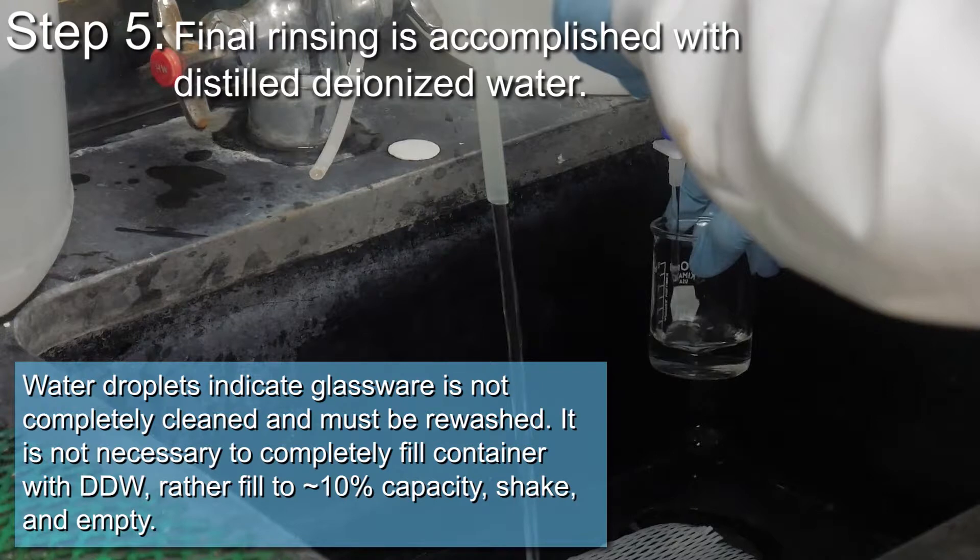It is not necessary to completely fill a container with distilled deionized water, but rather filling to 10% capacity. Shake and then empty.